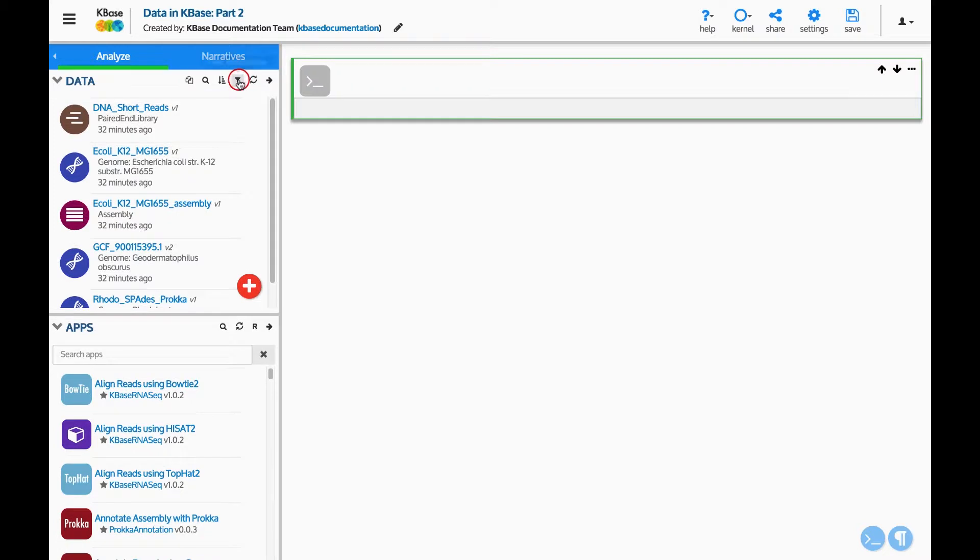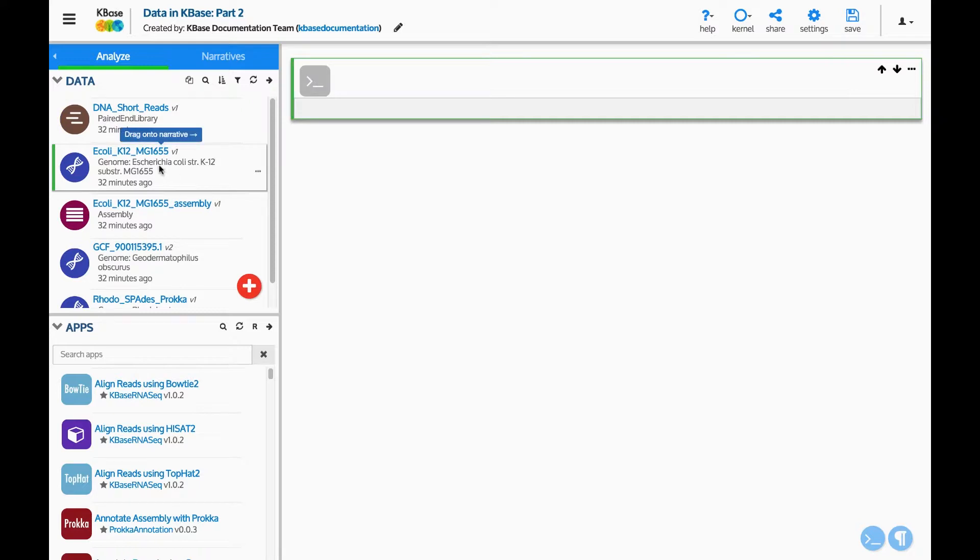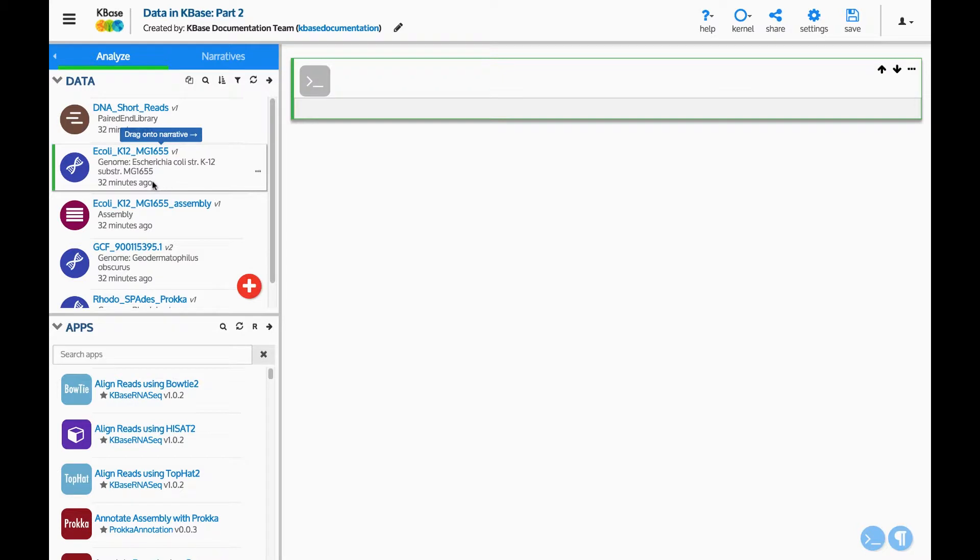Now that we know how to manage data, let's view it in more detail. Look at this genome. The top line has the name of the data and the version. The second line tells the type of data. A genome will also display the scientific name of the organism. The third line shows when this version of the data was modified in your narrative.